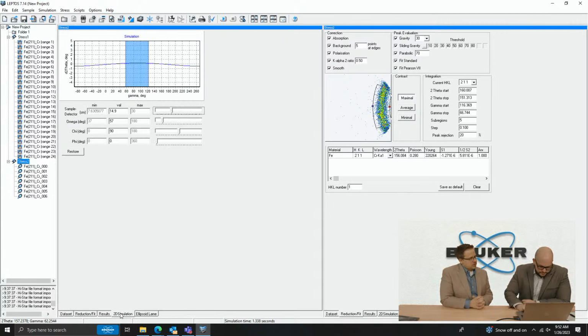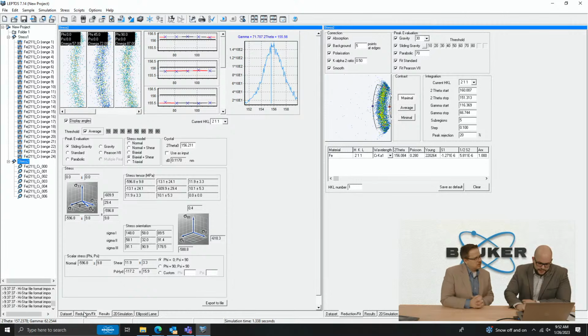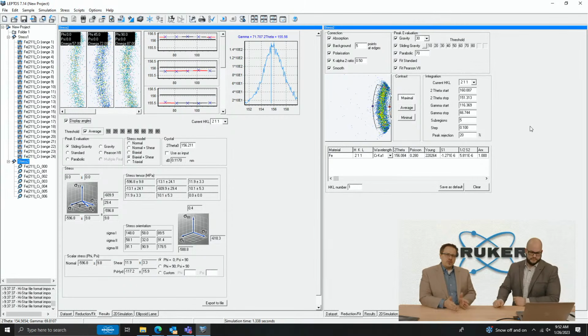Right here? Yeah, go to the calculation. Oh, gotcha. Here. Yeah. Here you can't turn them off. No, but we do have that peak rejection thing over here. It's been there, but it's only available for the 1D scan modes. What you can do if you want to use it is take your 2D data, manually reduce it to 1D, so integrate it out, and then bring it in. Yeah. And now you could use that, or you use that peak rejection thing.